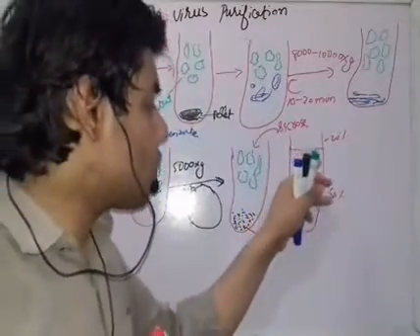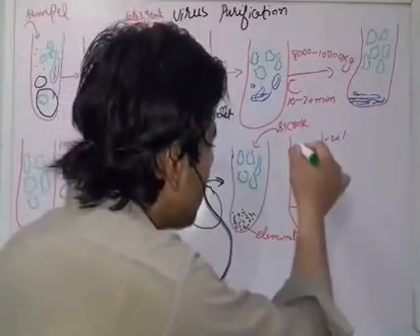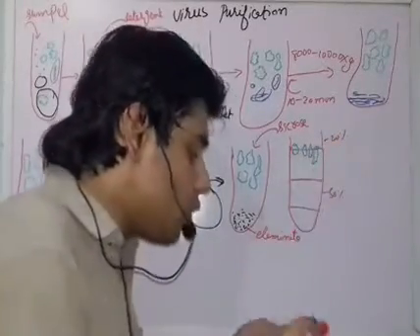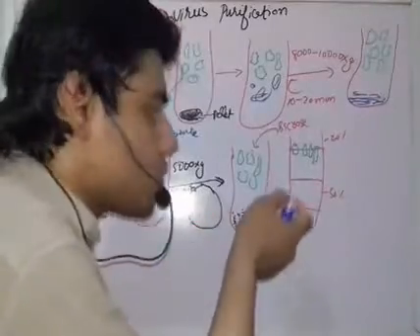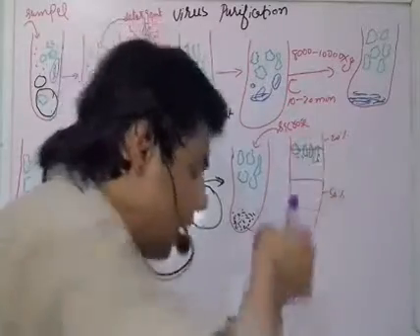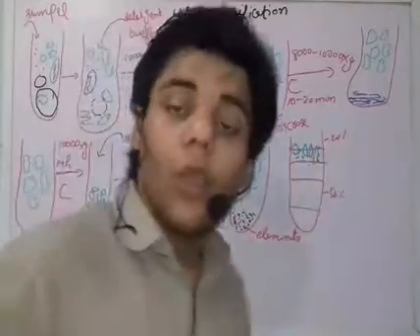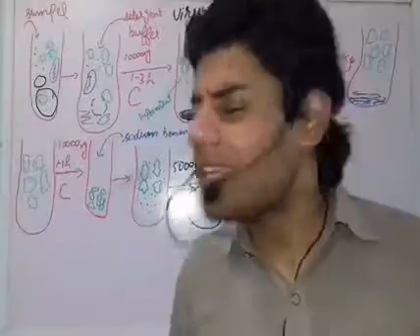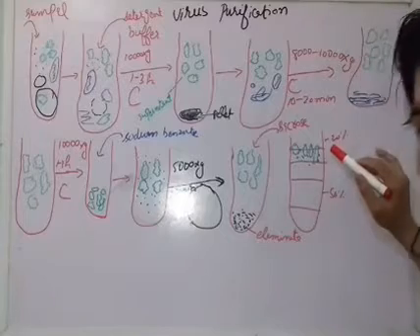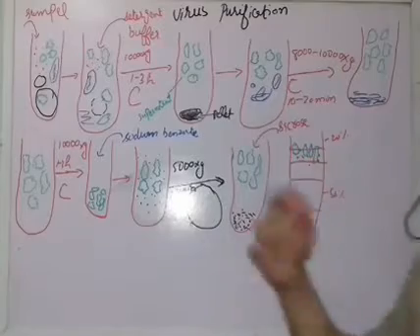Once we put the sucrose, the viruses which are present will not be the only thing to get to the upper layer. The other cellular content, other debris, or the remaining sodium benzoate, if present, will also be shifted to the upper layer, and the sucrose solution will also be present here. So we get the sucrose, the complete viruses, incomplete viruses, and also some protein or other debris.